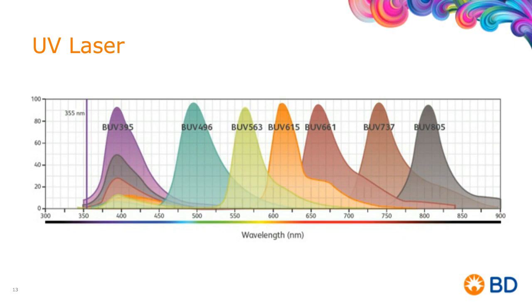And what we see in that continuum is that there are many different types of CD45RA. And that continuum is made up of a number of individual peaks. So what's important in flow sometimes is to spread that continuum marker out as far as possible because the biology gets spread. And if you don't use enough color, then it's all compressed into one place, and really there are different subpopulations there.